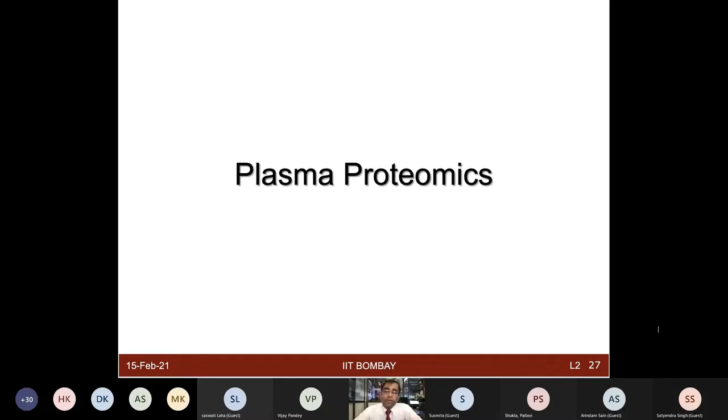And also when you are thinking about how to best do that for a given type of experimental platform, you have to think about the amount of protein required and the type of controls to be used beforehand, which is not possible when you are doing just routine protein extraction for normal electrophoretic-based work. So I'll stop here for this session.